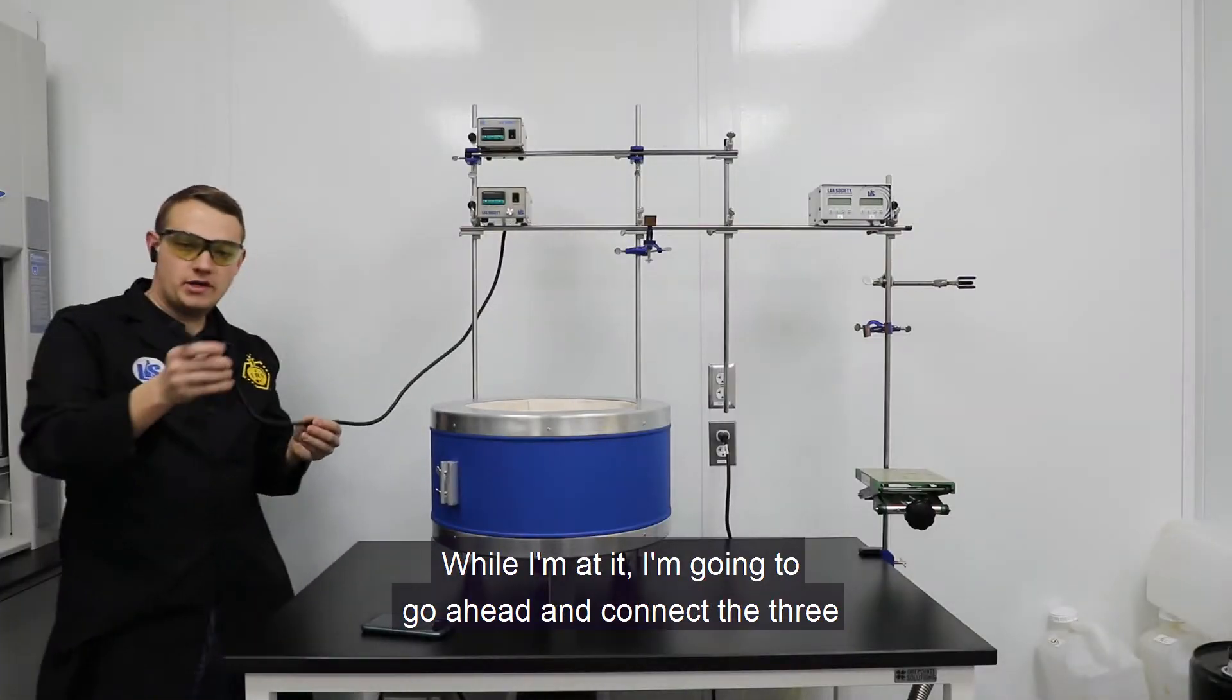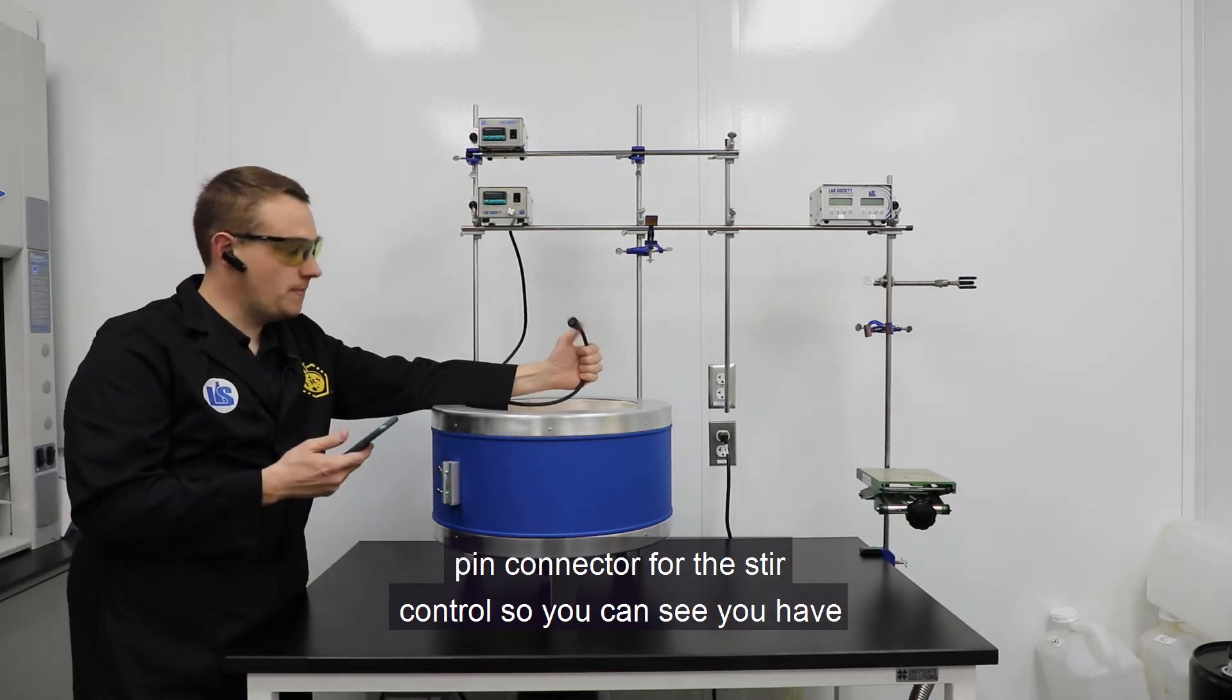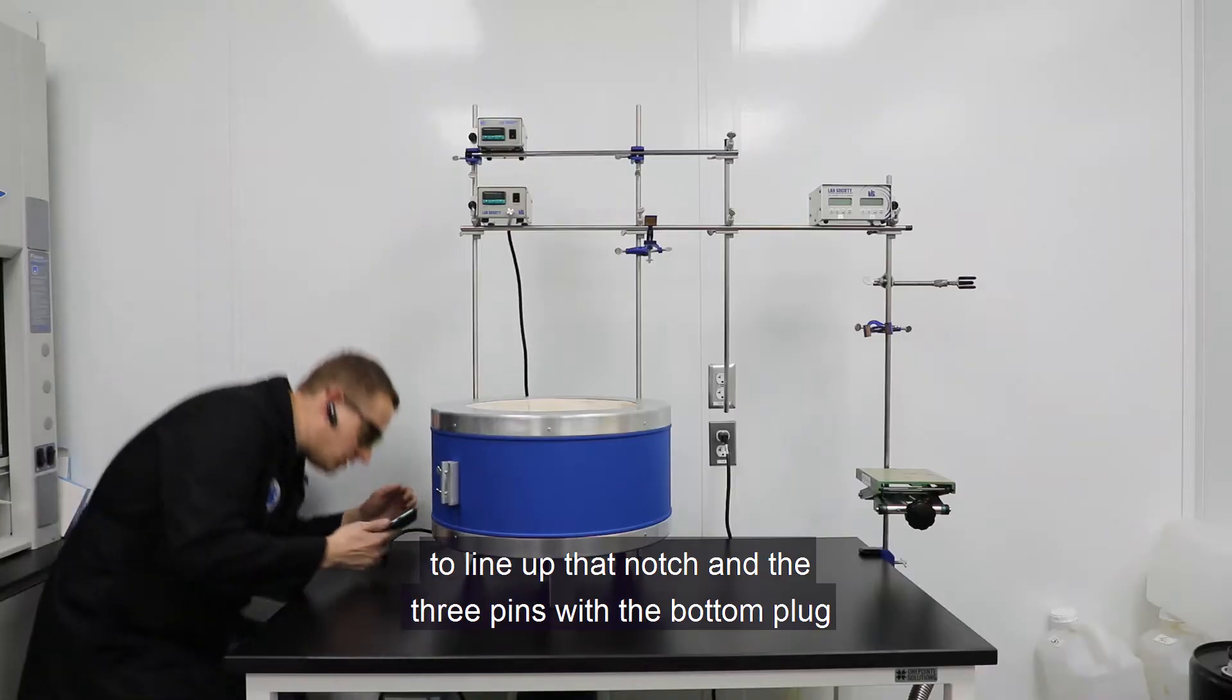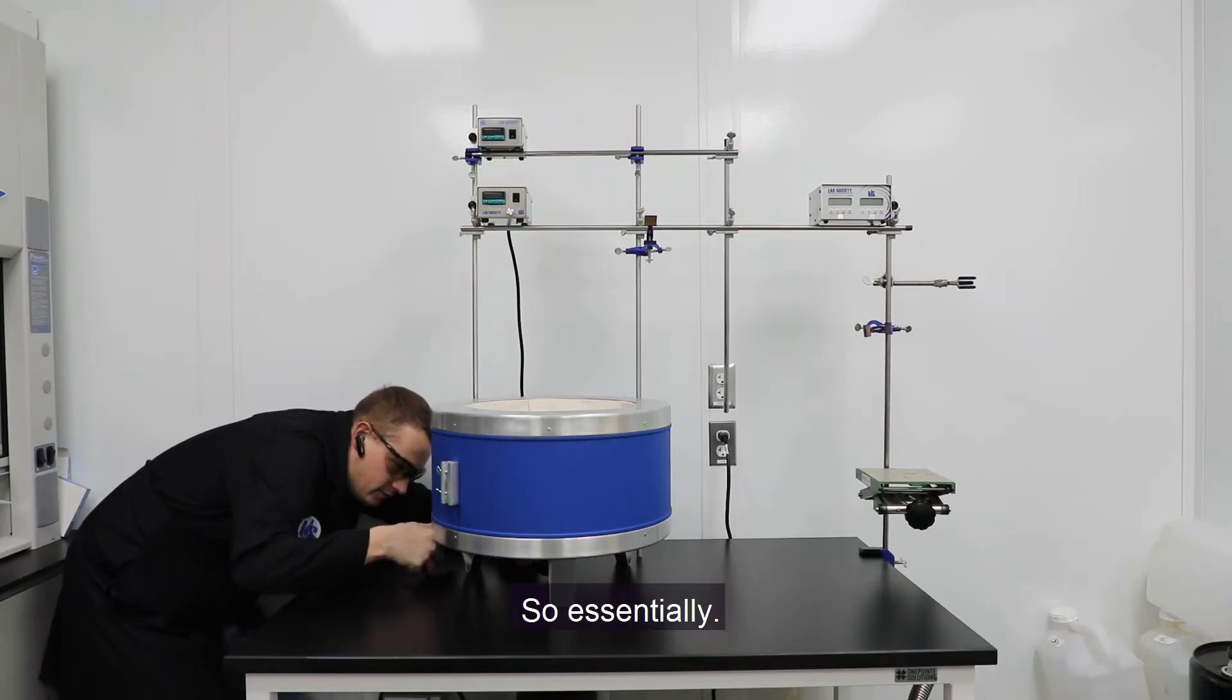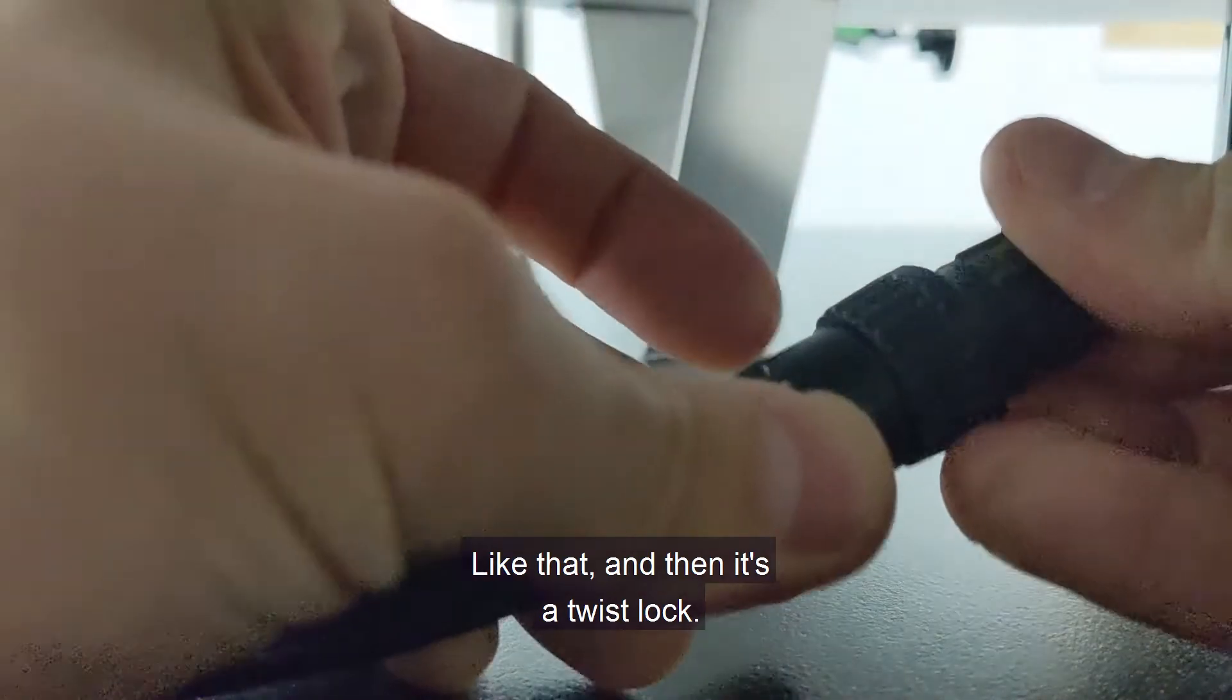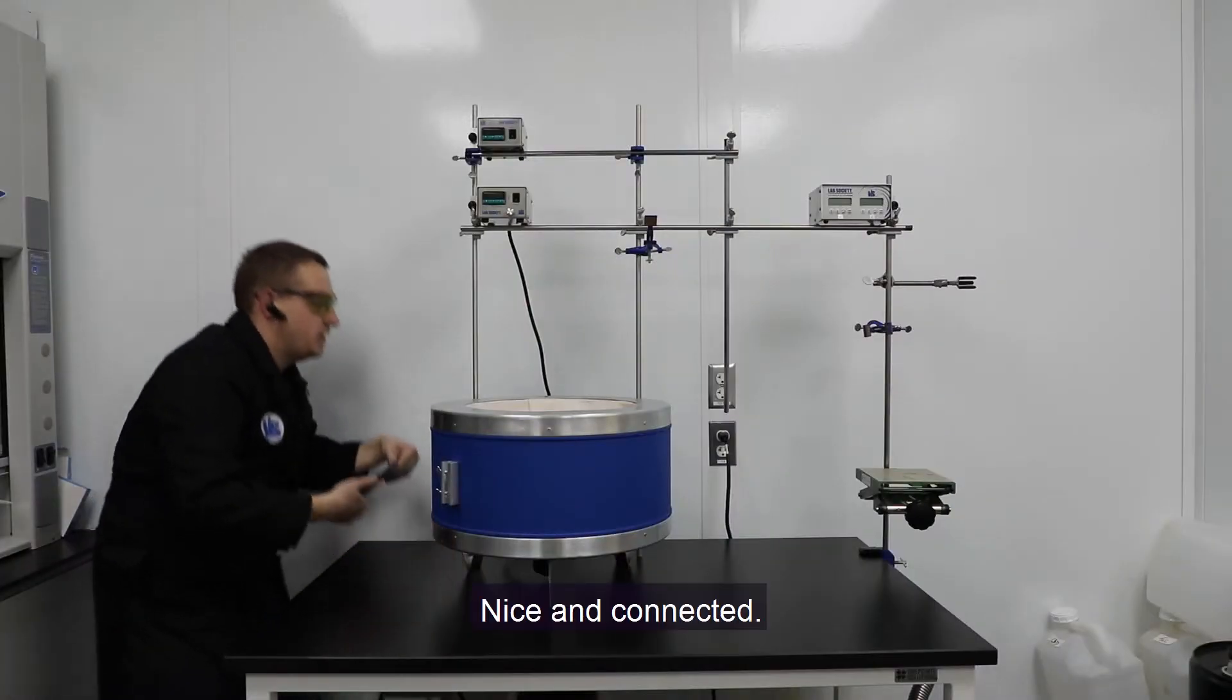While I'm at it, I'm going to go ahead and connect the three-pin connector for the stir control. So you can see you have to line up that notch and the three pins with the bottom plug on this mantle right here. So essentially, like that. And then it's a twist lock, so we'll just, boom. Nice and connected.